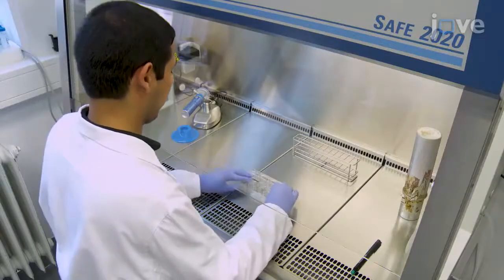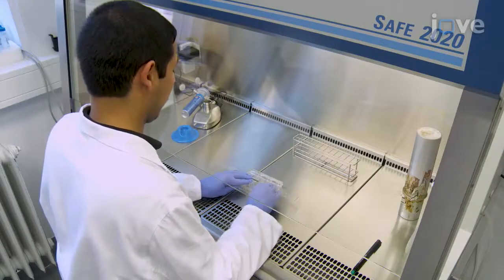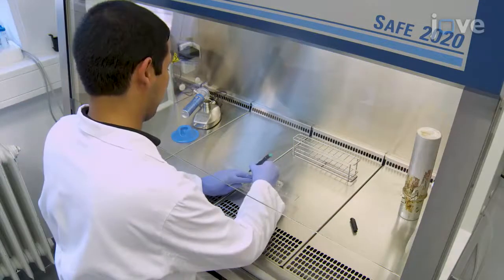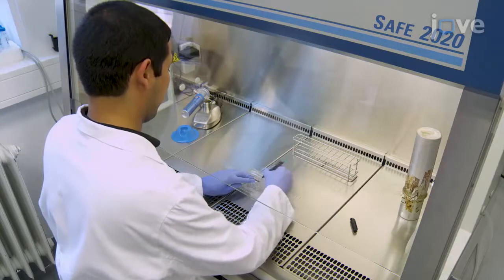Before beginning the procedure, use an ultrafine permanent marker to mark one six-well plate per cell type with a horizontal line at the bottom of each well to delineate the scratch region for each culture.